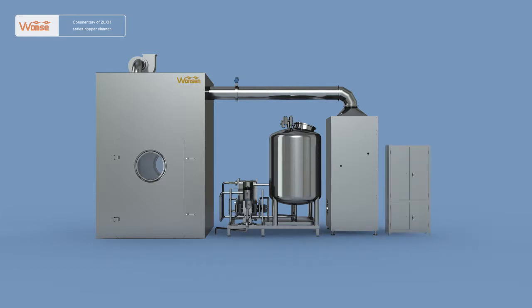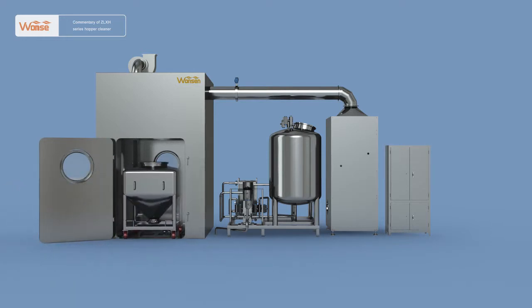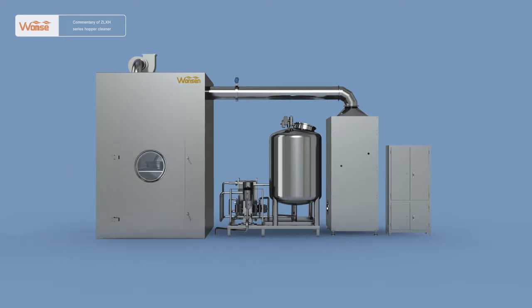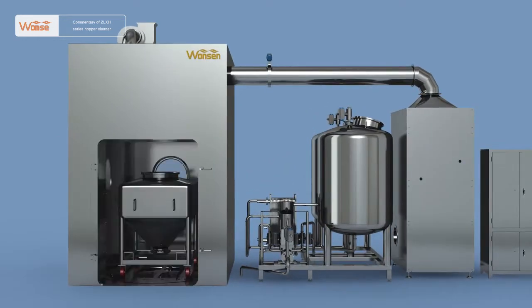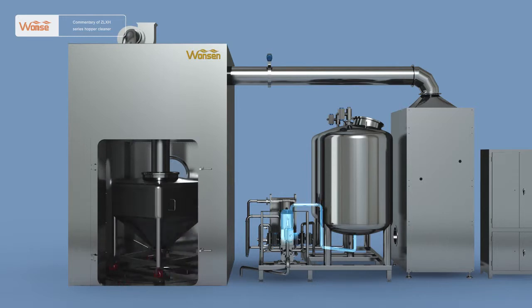The work procedure of the ZLXH-series automatic hopper cleaner is very simple. First, open the silo door. Push in the transfer hopper. Insert the wheel guard and close the silo door. Press the start button. The cleaning nozzle at the top will automatically stretch into the hopper, and the rotary tray will start to rotate. Open the water discharge pipe pneumatic ball valve at the bottom, and the cleaner will start to work.